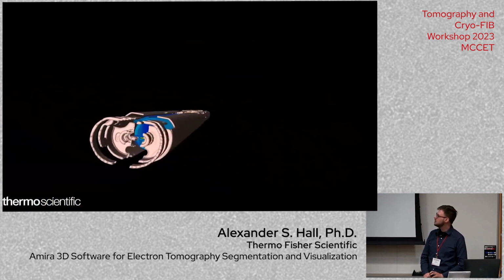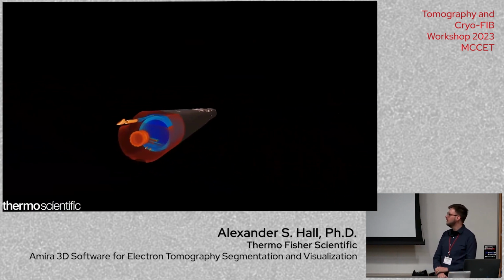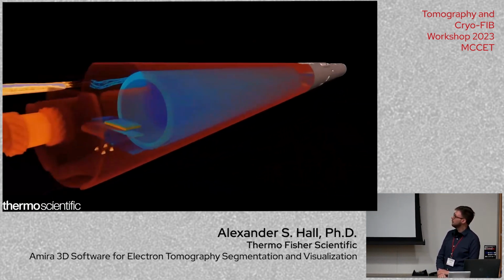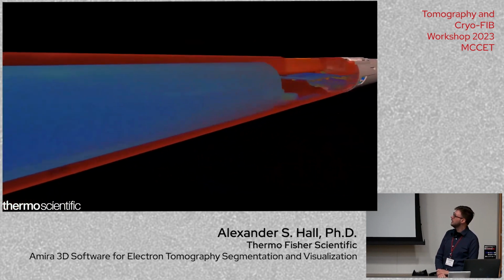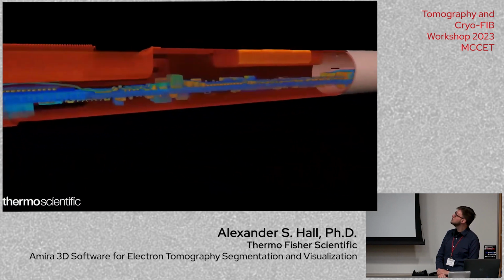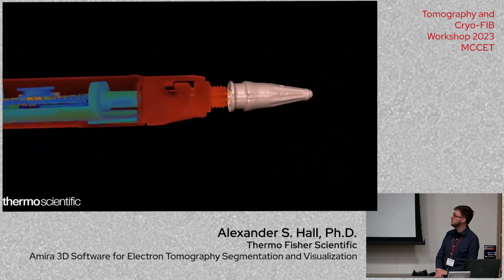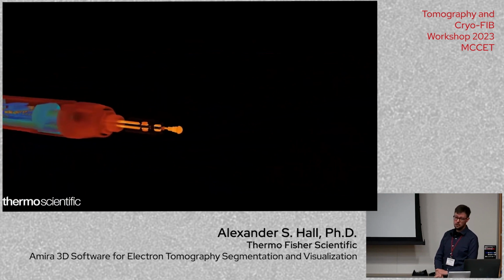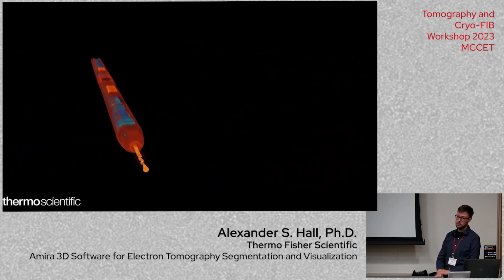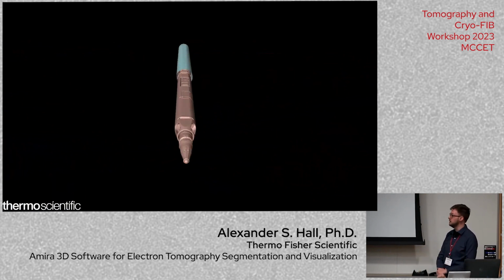And the reason I'm showing this animation, there's two reasons. One, to show you how segmentation looks. So we're looking at the raw image data now with the kind of hazy orange color. But you saw there was also a surface overlaid, and that's a kind of segmentation, which is just a fancy term image processing people use for isolating regions of interest. And you do that for visualization, but also for measurement purposes.